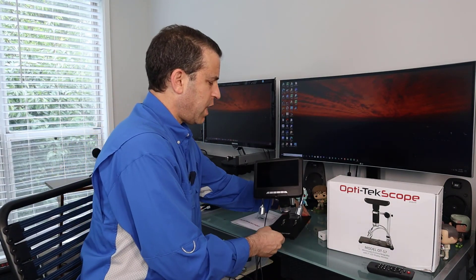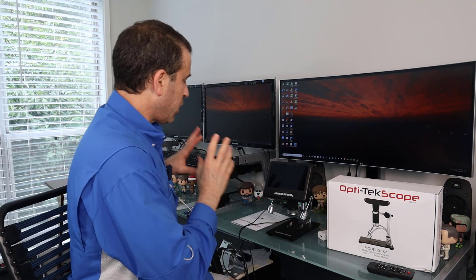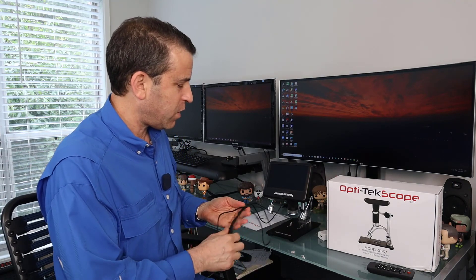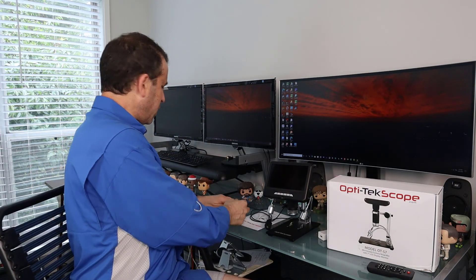What I want to do next is bring my camera in closer. We're going to look at some products and dive in there — I'll show you the different features. You'll be able to have fun with this yourself should you move forward with it. It's really cool when you actually get real close to a product and it's like, wow, that's pretty neat. So let's go ahead and set this up and have some fun.